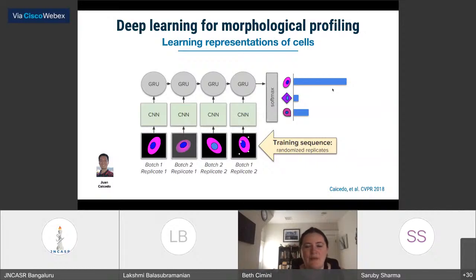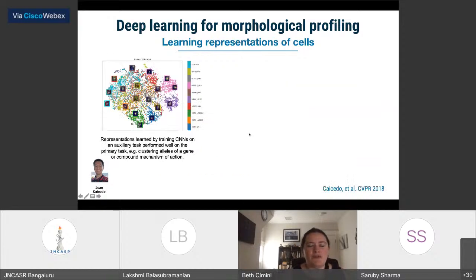We treated the cells. But by training a network to try to guess for each cell which drug it was treated with, he trained a network that ultimately measured something interesting about what drug treatment does to cells. And so by then throwing out this ultimate end goal of guessing which drug a cell is treated with, because we always know that ahead of time, and just taking the network, he was able to treat the different parts of the network just like a texture feature or a shape feature or an intensity feature.